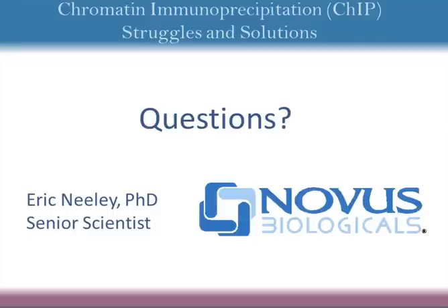That amplification that I'll see for that same primer set and that same antibody will be within 2% every time, over and over again, and that's also very important if you are trying to compare different treatments that you didn't do at the same time, to show that the results are similar.